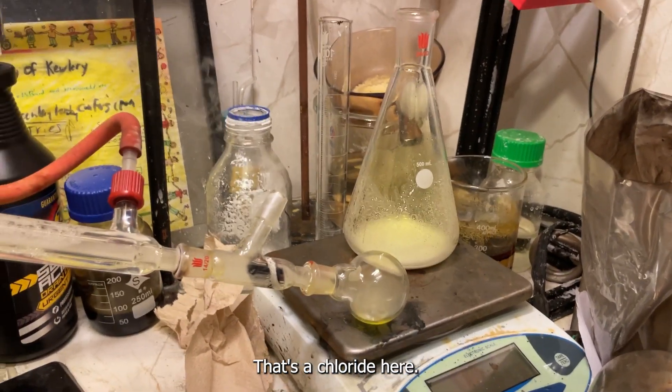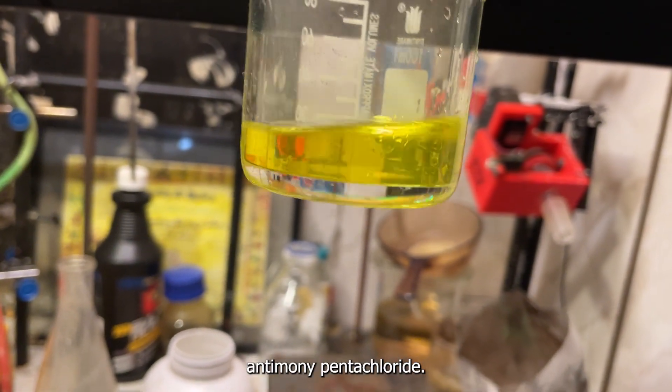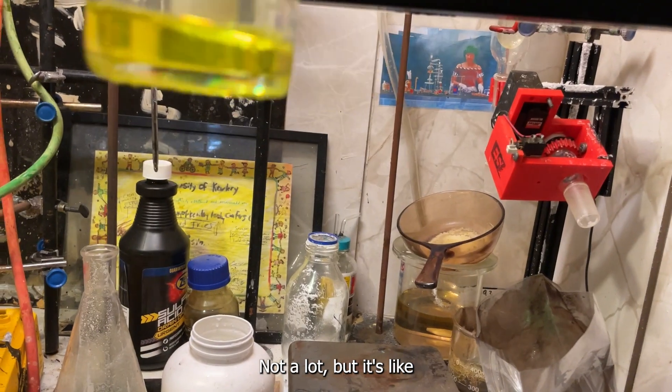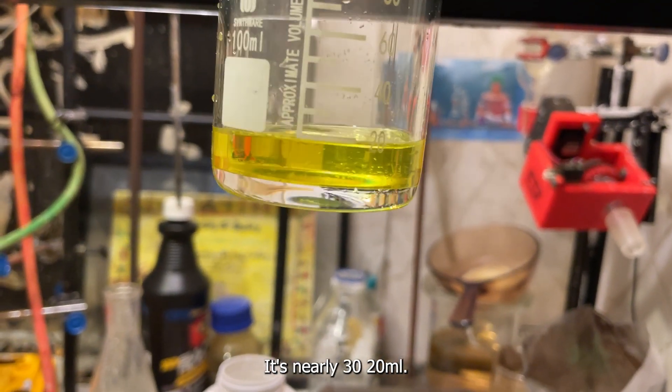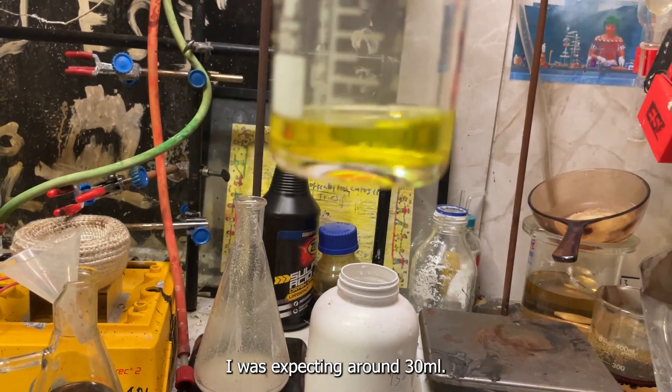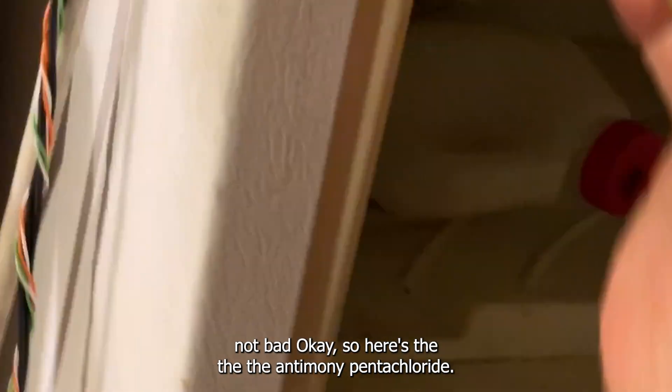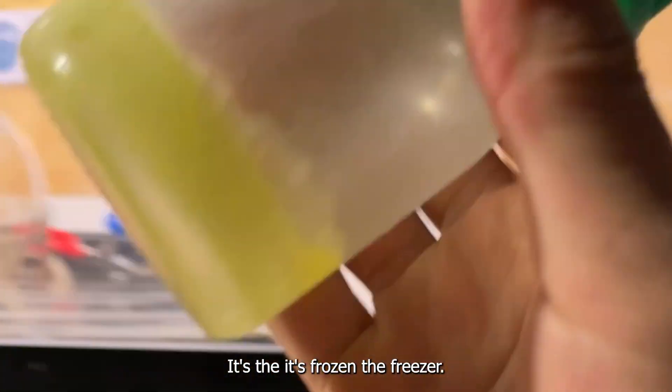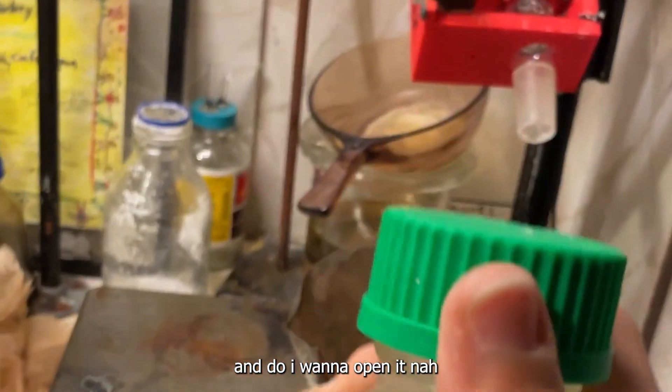So there's our final antimony pentachloride. Not a lot, but it's a decent amount. It's nearly 30, you know, 20 milliliters. So that'd be 75% yield. I was expecting around 30 milliliters, I believe. But not bad. Okay, so here's the antimony pentachloride. You can see it's frozen in the freezer. So this is pentachloride. So that's a good sign. And I don't wanna open it. Nah. Back in there it goes.